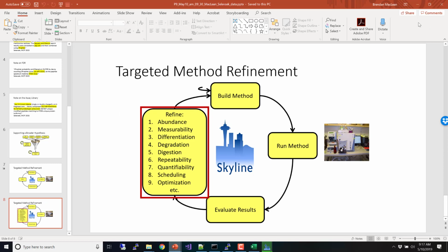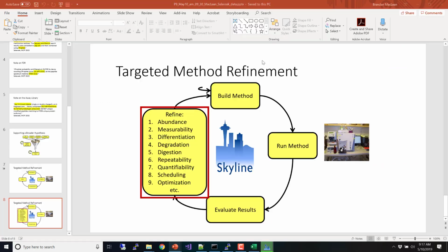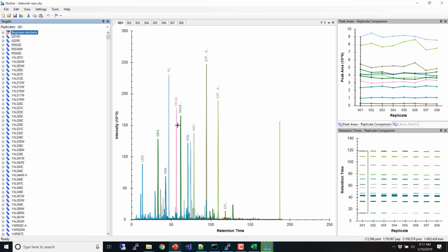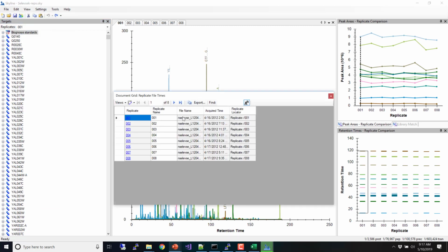Degradation. So the nice thing about measuring a day apart is that peptides that are degrading are going to produce higher CVs, right? So I feel pretty good about that. But if somebody told me, yeah, I did my CVs based on these first 3 replicates, which are measured in less than 12 hours apart, maybe that's not as useful.